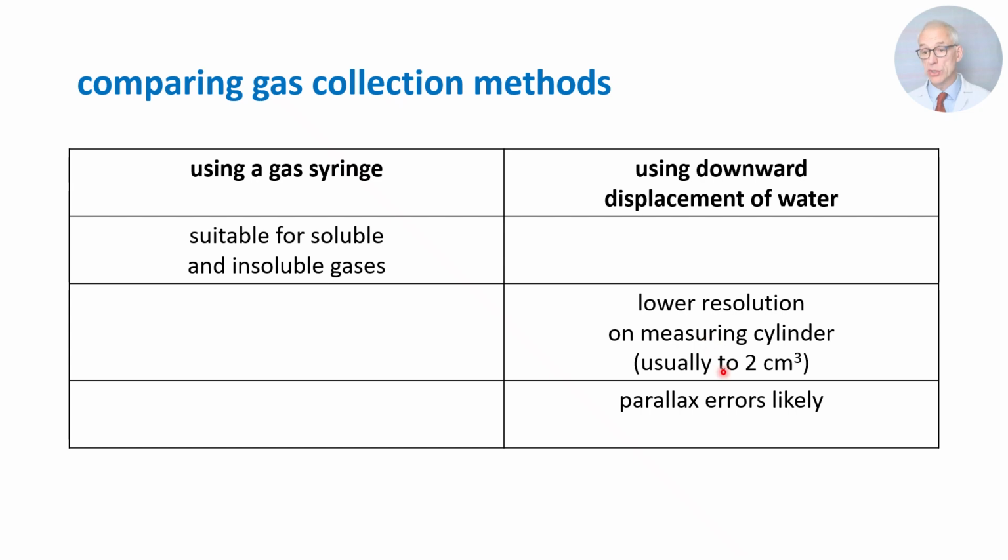Similarly, I've got 2 comments for the downward displacement of water. What would be the counterpart comment for the gas syringe? Stop. Think about statements that could be made about, for instance, the solubility, insolubility of gases using the downward displacement of water method, and similarly for the 2 other ideas. Write something down, come back to check against my answers when you are ready.